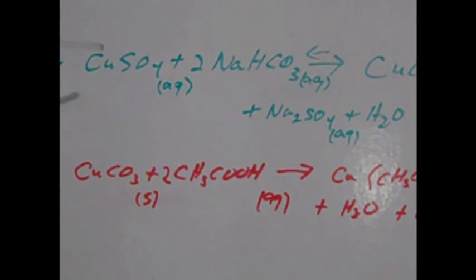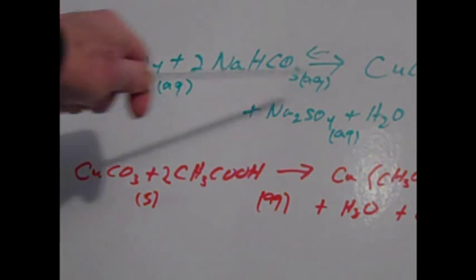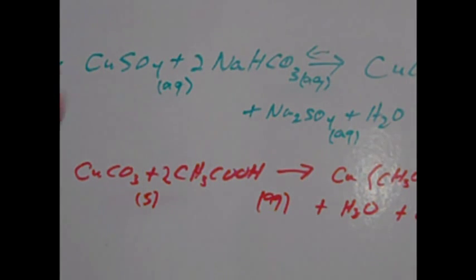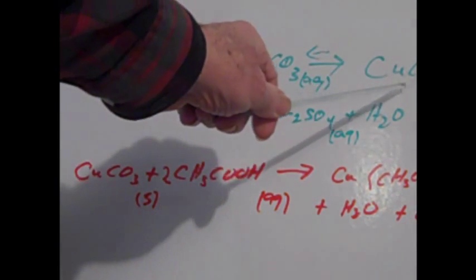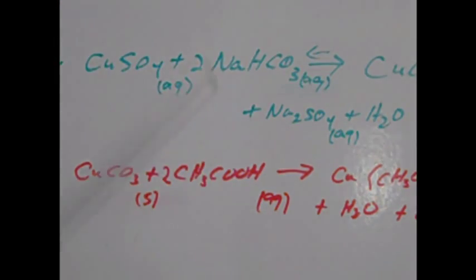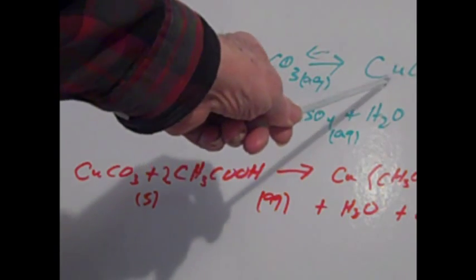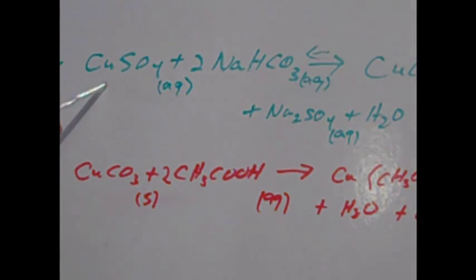What happens is the copper sulfate, which is soluble, reacts with the sodium bicarbonate, forming the solid copper carbonate precipitate. And when that happens, copper 2+ ions are in the solution, as well as copper carbonate precipitate in the solution. And what we do then is we react this copper carbonate with vinegar, changing it back to ionic copper. So we have pure copper 2 color back in the beaker again. That's it. I hope that helped you.